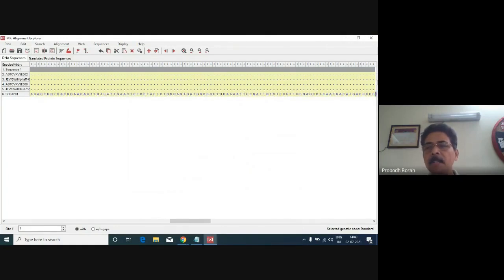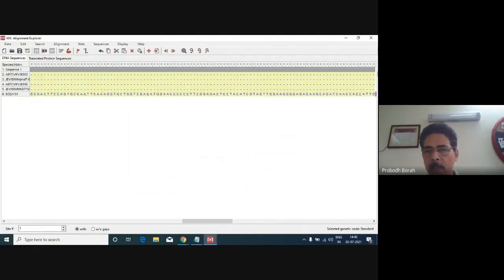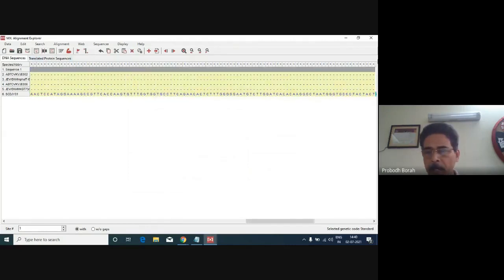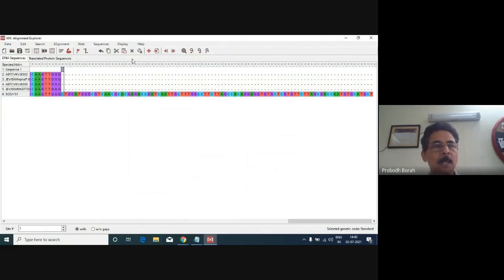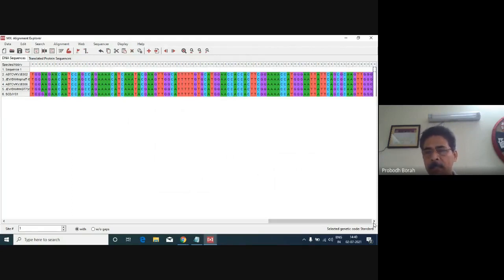Because the last sequence is too long, that's why it is taking some more time. So the entire part which is not common should be deleted. Okay, now it is deleted totally.